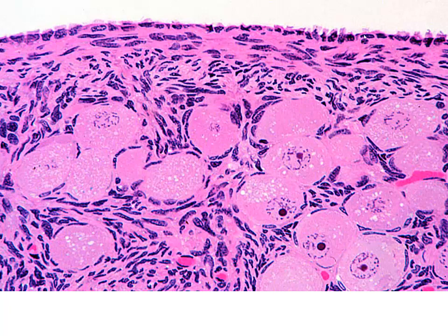Looking a little bit closer, we can see our germinal epithelium at the surface. This is cuboid shaped in nature. We have the tunica albuginea, our connective tissue. Then we have our first type of follicle. This is going to be our primordial follicle.